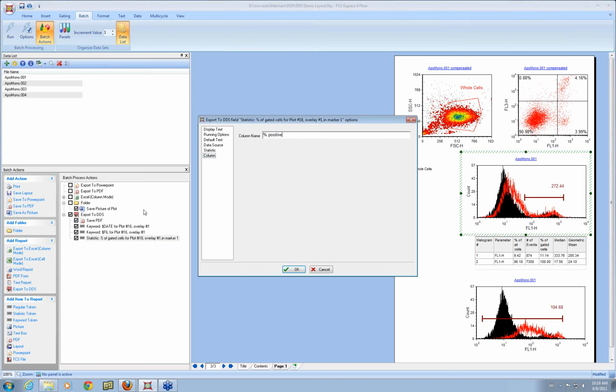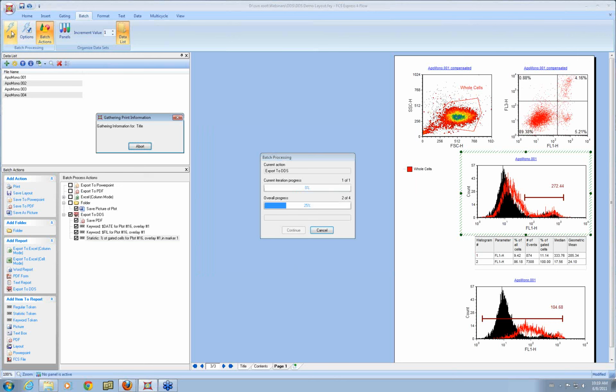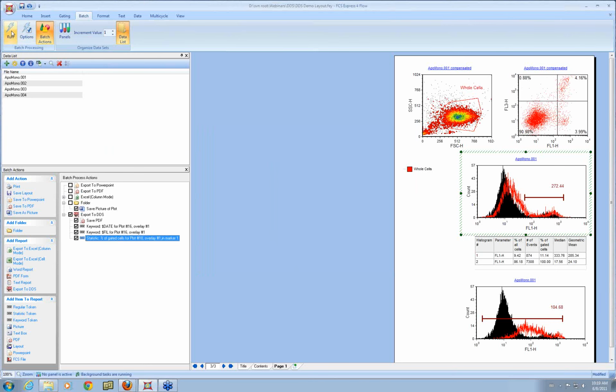And it told me that it was blank, even though it looks like it's not blank. So that's an interesting result. Let's try typing that again. And I'm going to try running this again and see if we get a similar error. Okay, so there was a momentary glitch, and I'm going to look at that and see if we can resolve what that problem was. But in the meantime, all I had to do was type it in again and press OK, and now it was uploaded.